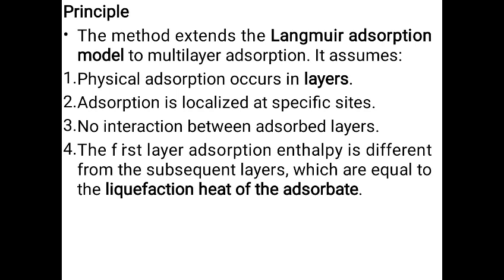The difference between adsorption and absorption is that in adsorption, the molecules stick to the surface of the material, whereas absorption means the molecules are completely taken into the volume of the material.